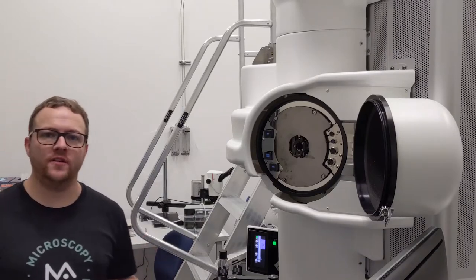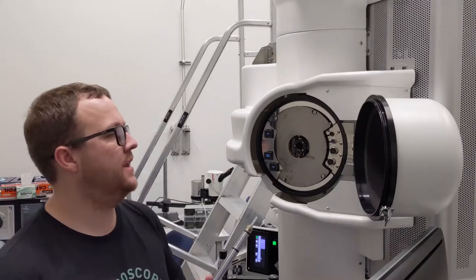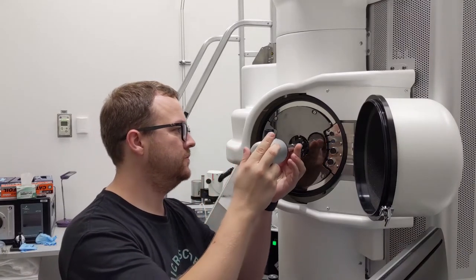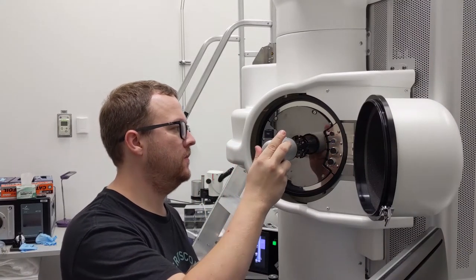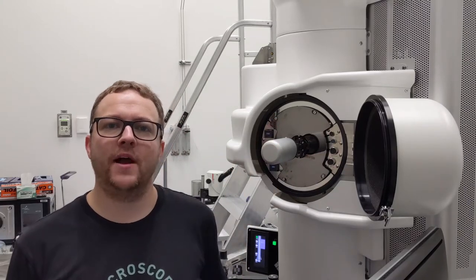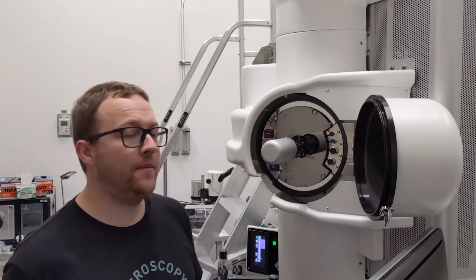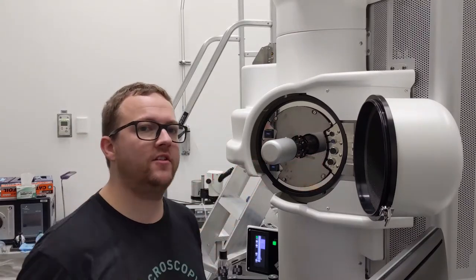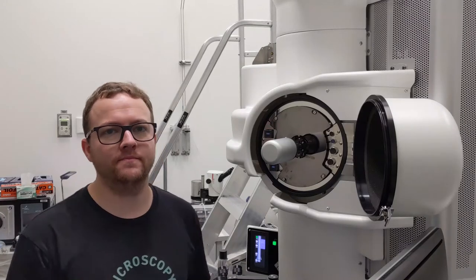With the sample in the holder, we now put the holder into the microscope, like so. We then need to wait for the microscope to pump down the sample chamber, at which point the rod will be fully inserted into the microscope.